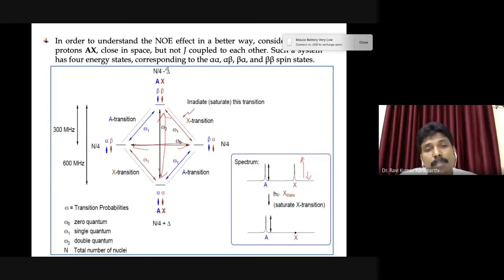So these are the different transitions that are possible between the two dipoles upon the interaction of these separate individual dipoles. So in the case of NOE, what exactly is happening? The dipoles are interacting, and they are transferring their spin from one spin energy state to the other spin energy state. There is a polarization transfer happening. Spin polarization transfer is happening in this system. Therefore, we see either enhancement or decrease.